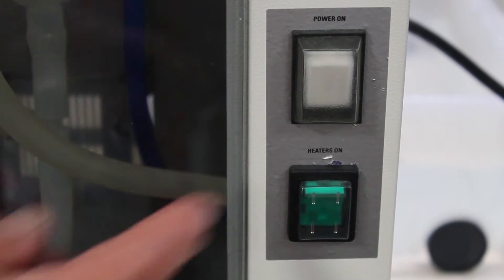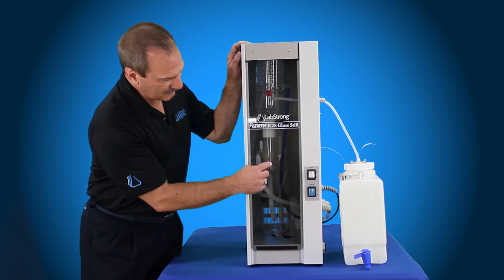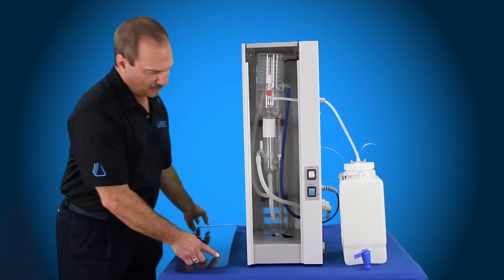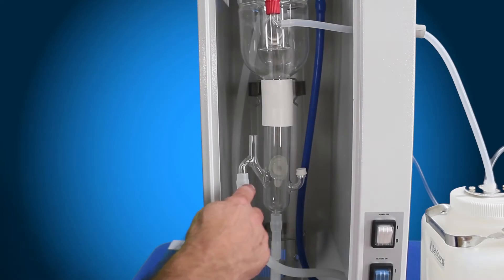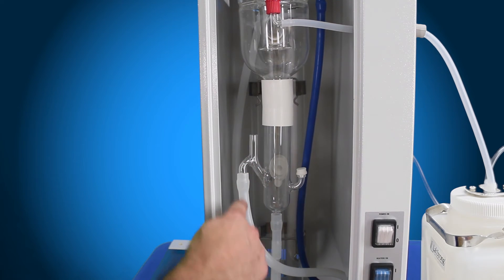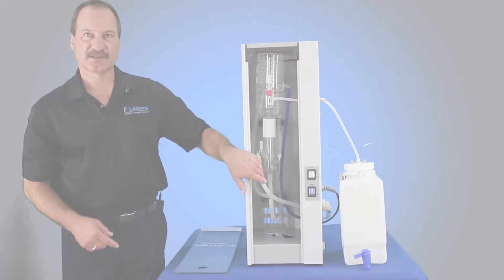Once you flip that on, that's going to energize and let water fill into the system. Once water fills into the system, it gets up to the constant level device — we'll remove the door here so you can see this a little easier. Water will travel into the coil, come down, fill up the boiler, fill up the boiler and the constant level device, and when it gets up to this level it starts overflowing and going down to drain, and that's going to energize the heating elements.